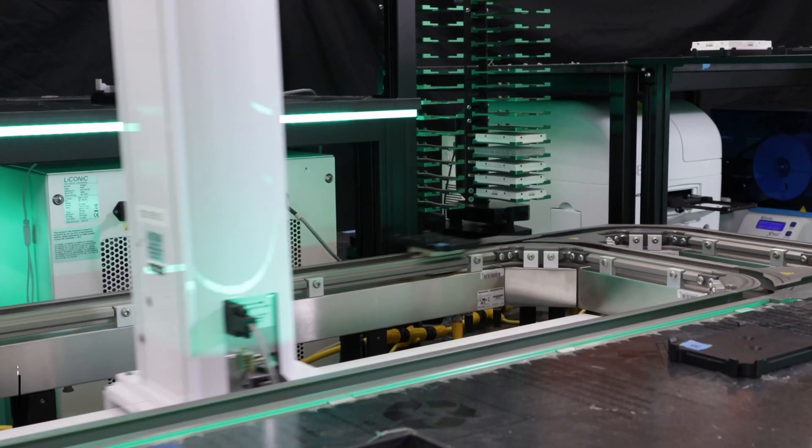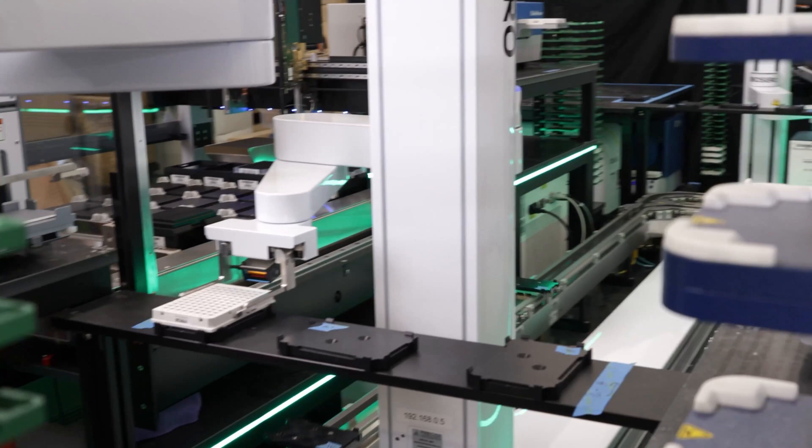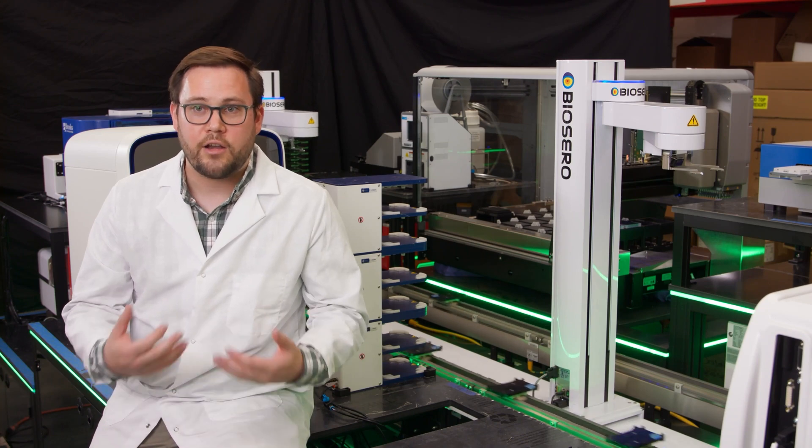Over time, we've noticed that although certain systems can benefit from subsequent upgrades like adding other instrumentation, robot arms, storage capacity, etc., the future of lab automation is built around making sure that the entire lab and the automation within it is used in a collaborative process.